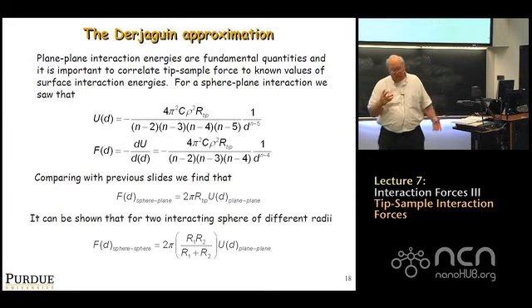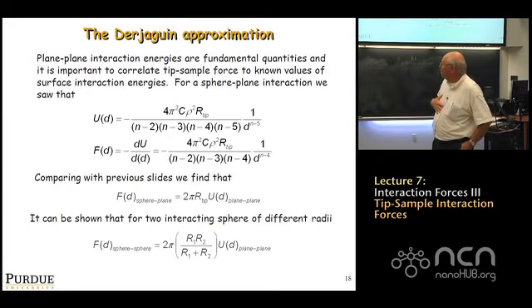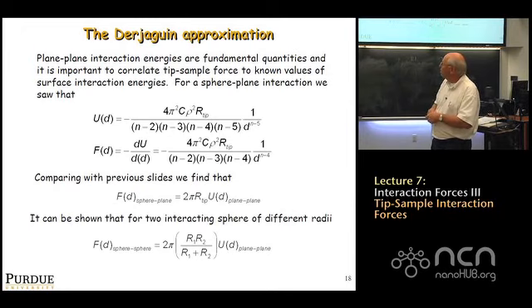The next topic is a way to get at these plane-plane interaction energies, which are the fundamental interaction energies, right? These plane-plane interaction energies are governed, in principle, by this surface energy gamma. And the question is, can you do a measurement with a tip that allows you to learn something about how two planes interact?